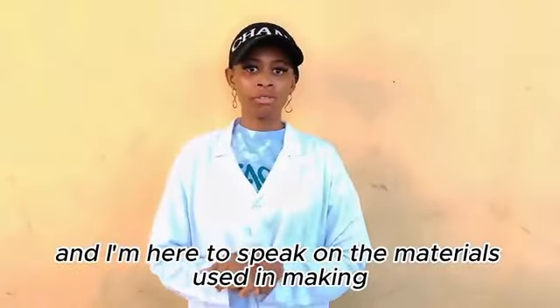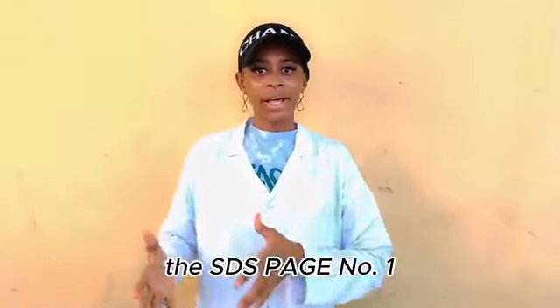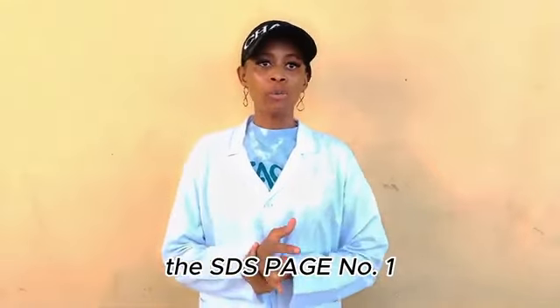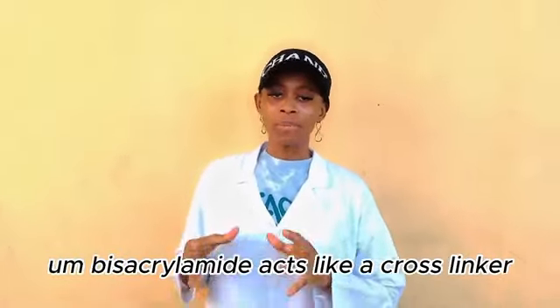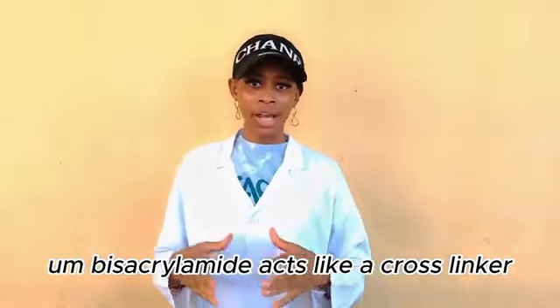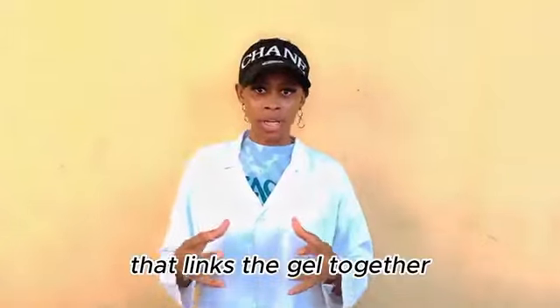I'm here to speak on materials used in making the SDS-PAGE. Number one, we have the acrylamide and the bisacrylamide. The acrylamide makes the gel, while the bisacrylamide acts like a cross-linker that links the gel together.